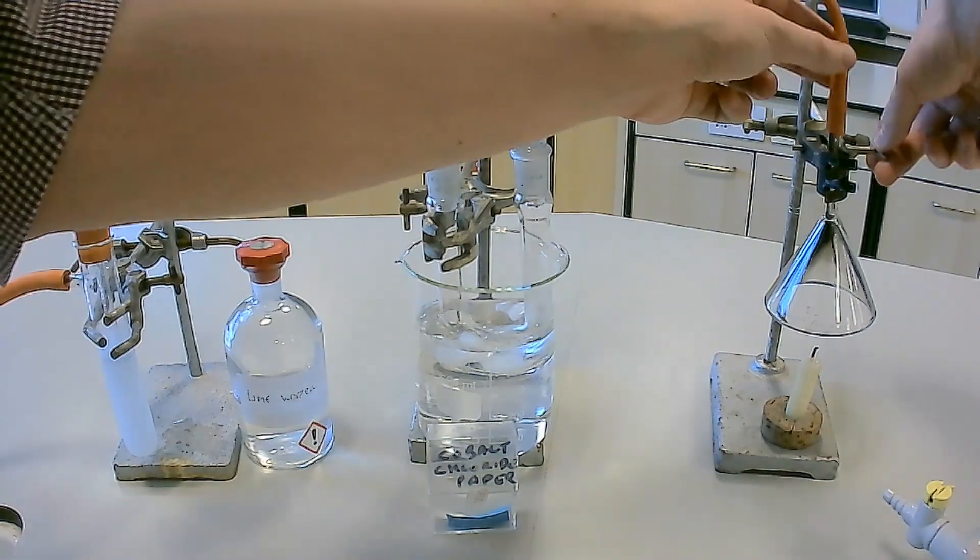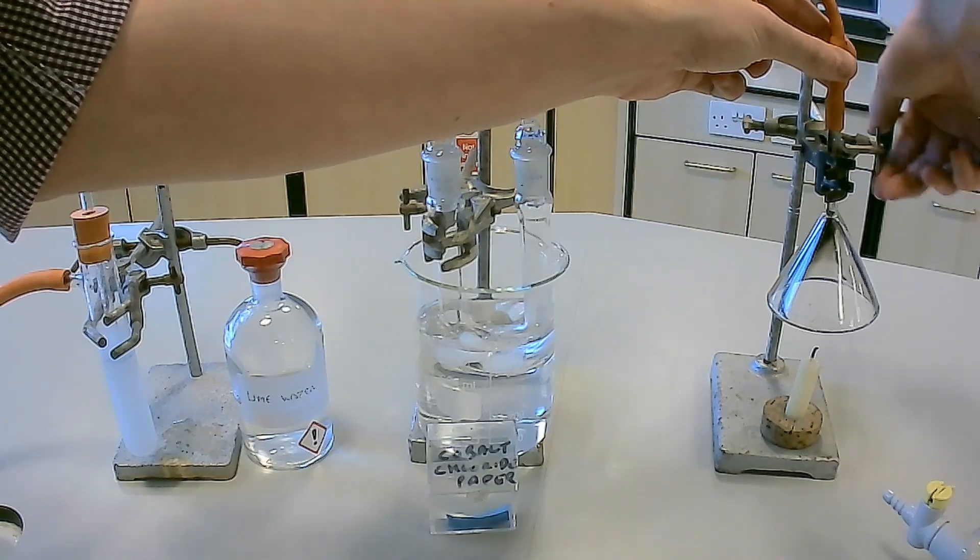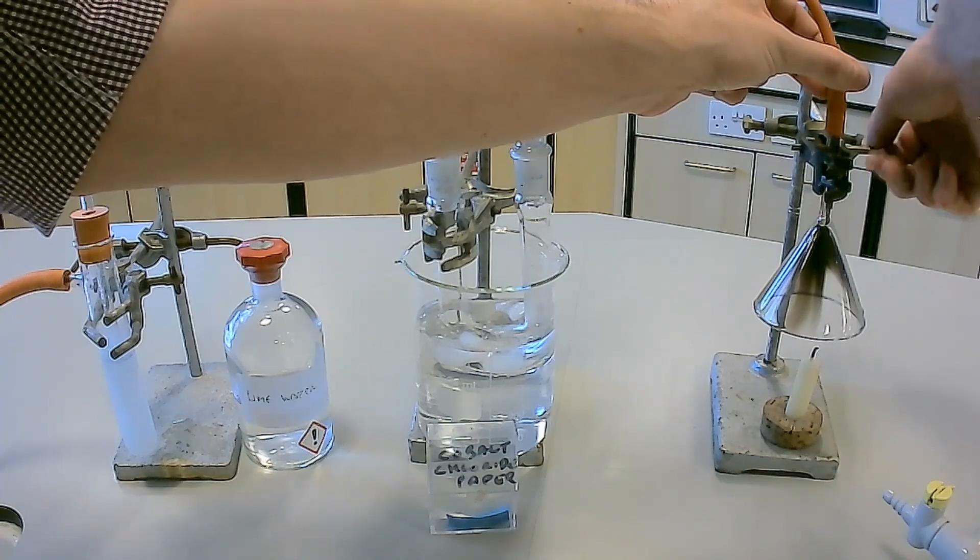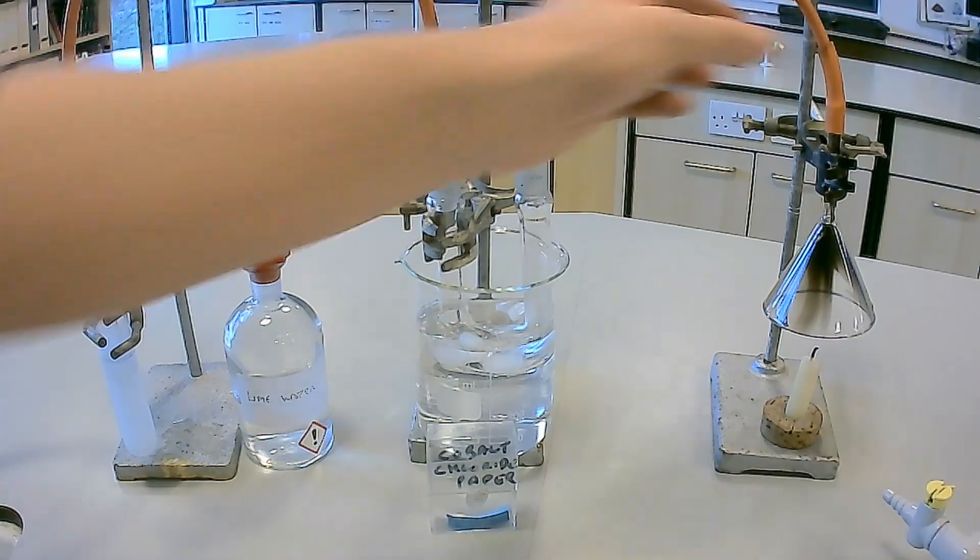At the end of the experiment, notice the build-up of black soot, which is carbon, on the glass funnel above the candle. This is due to incomplete combustion caused by insufficient oxygen as the candle was burning.